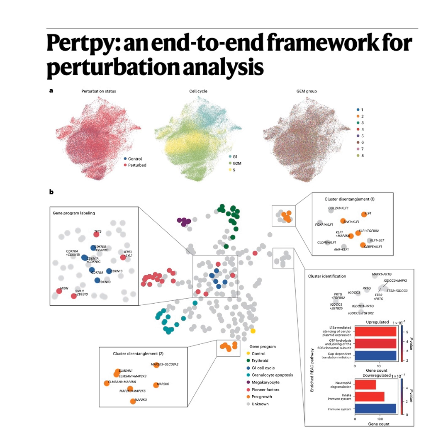Checking if the perturbation actually worked. The escapees. Exactly. Just because you hit a cell with a CRISPR guide doesn't mean the gene was actually knocked out. They are a huge source of noise that can completely dilute your signal. So you average in a bunch of cells where nothing happened. Yeah. And your effect looks weaker than it is. Or it disappears completely. So Pertpy includes a fast, JAX-optimized implementation of a tool called Mixscape.